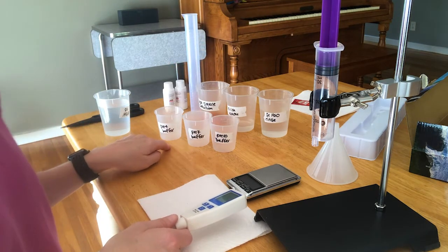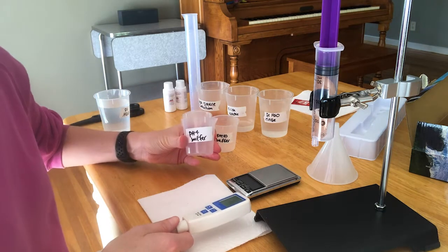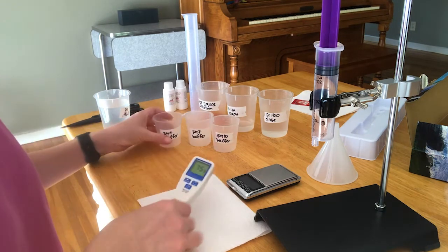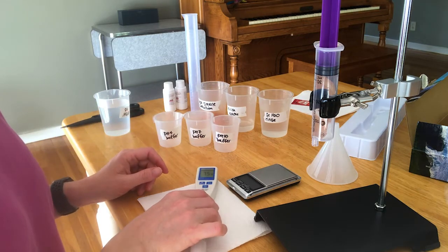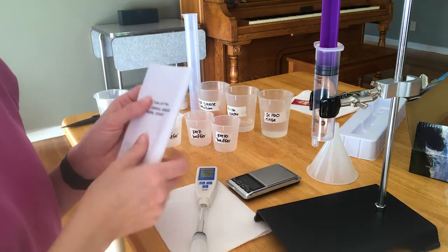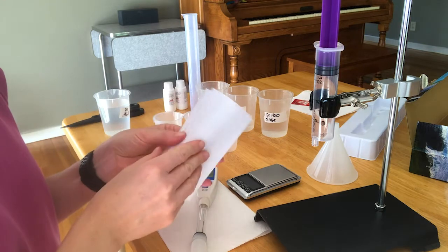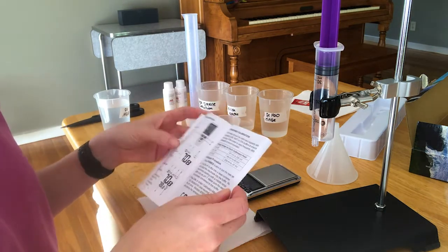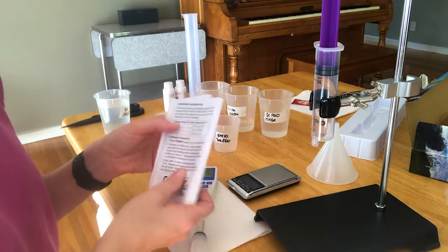We're going to calibrate it using these three buffers that come with your kit. These act as reference solutions so that the pH meter knows, okay, this is what a pH 4 solution looks like, this is what a 7 solution looks like. The instructions are in this booklet that comes with your pH meter. You're just going to perform a standard calibration.